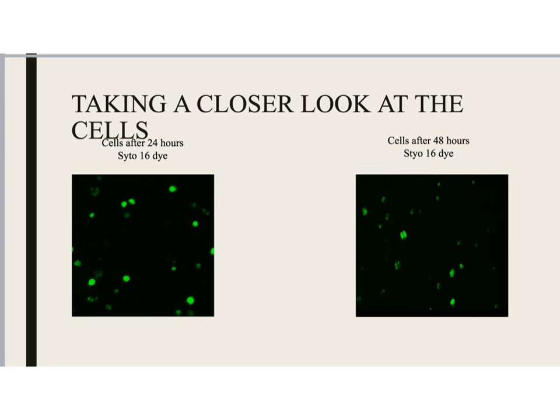So here you can see that we did see forms of apoptosis, and there could be more apoptosis in the neon cells, but in the brightness we had on the microscope, they're not able to be seen to see if there's apoptosis, because if we were to dim down the brightness, then we would have lost all the other cells that I just circled.